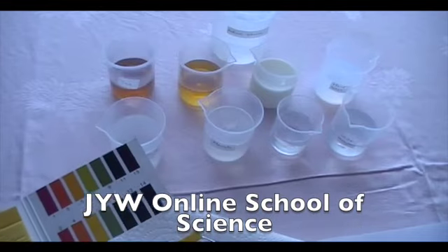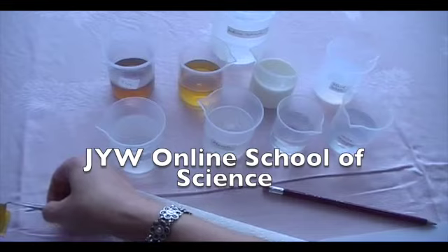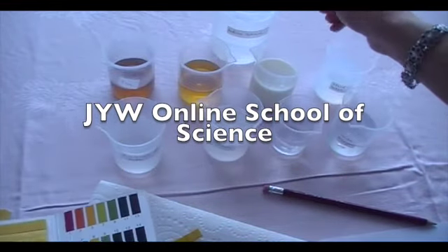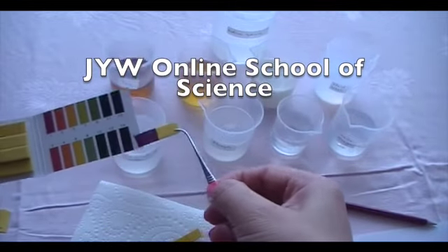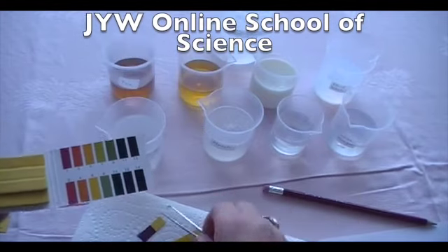That's milk. Last one, we look at this sodium hydroxide. Sodium hydroxide, can you see the color? Very dark. pH 14.